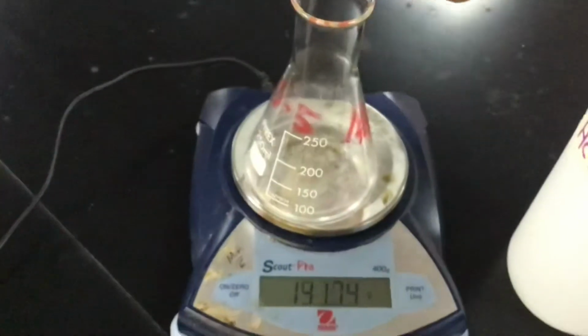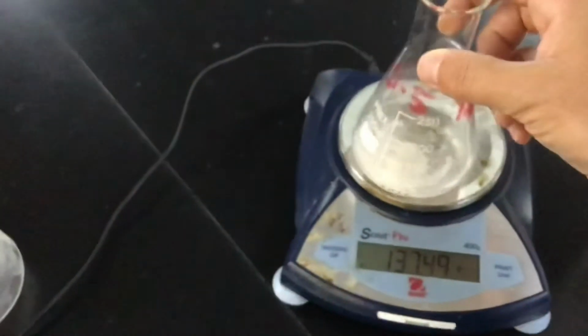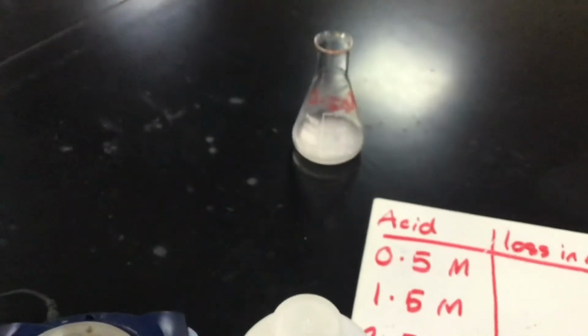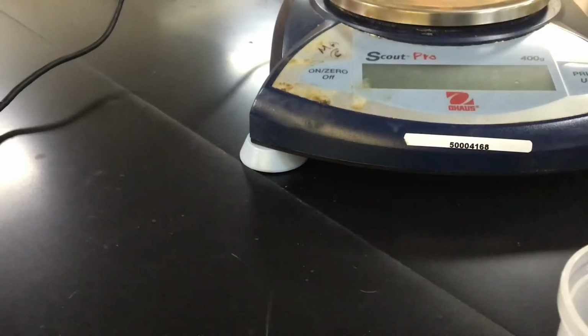So what we will do is combine the marble chips with the hydrochloric acid. You can see that reaction taking place and that gas being released. We'll put that to one side until it's finished. 1 minute and 39 seconds on the video. Then I will do the same with the 1.5 molar.